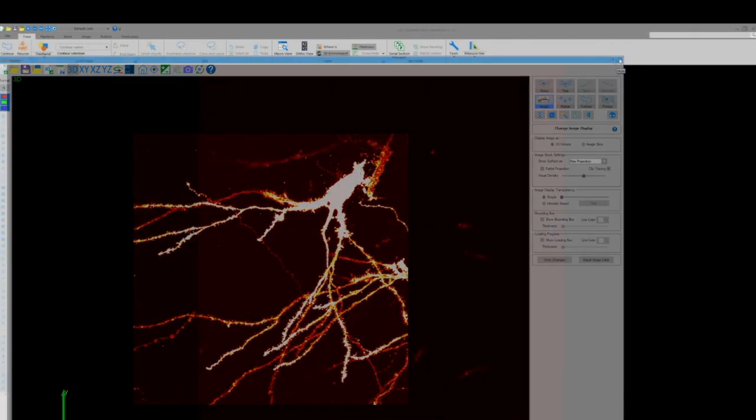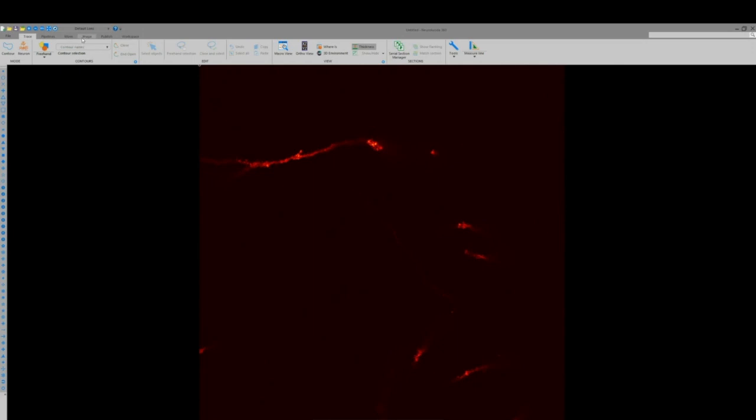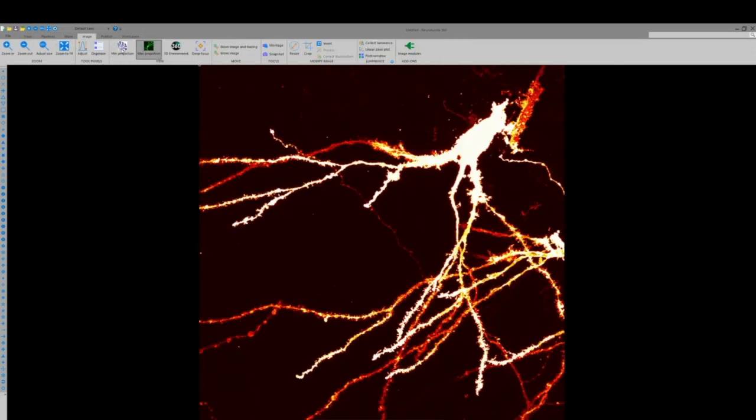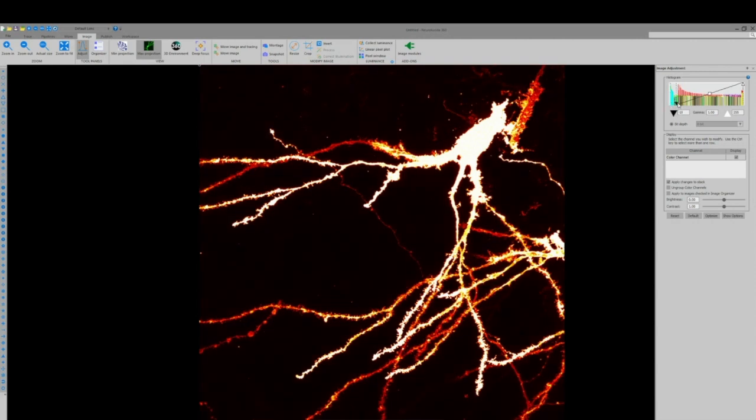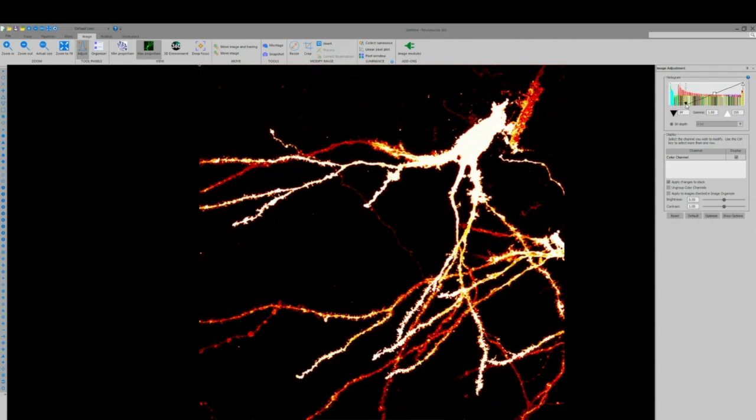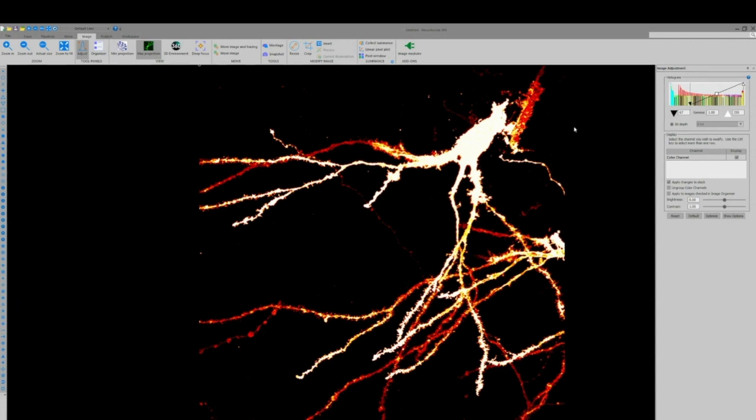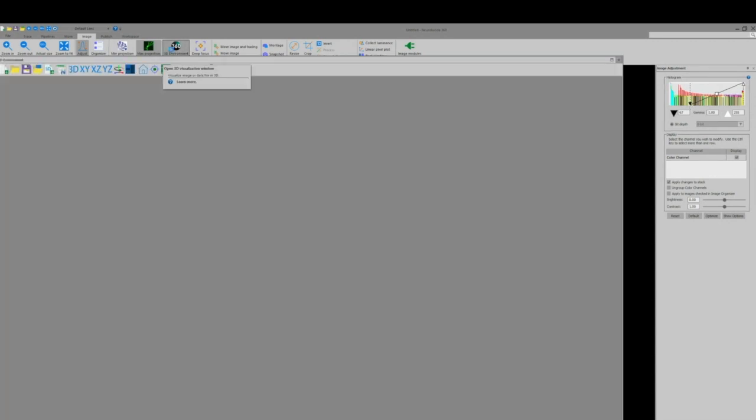Now panning over to the 2D window we'll select the image toolbar, max projection for fluorescent images, and open the image adjustment window where we can use this histogram on the right to decrease background noise in our image and increase the contrast which results in better accuracy when automatically detecting microstructures such as spines.